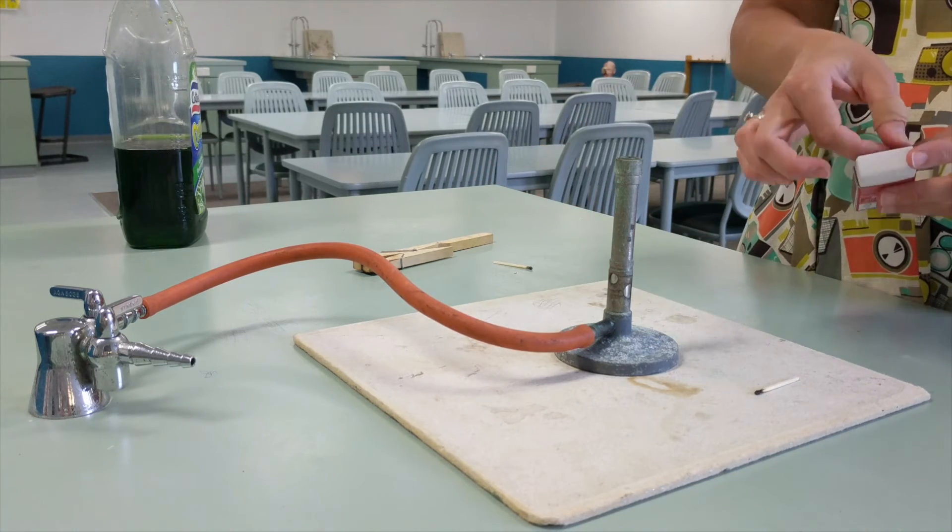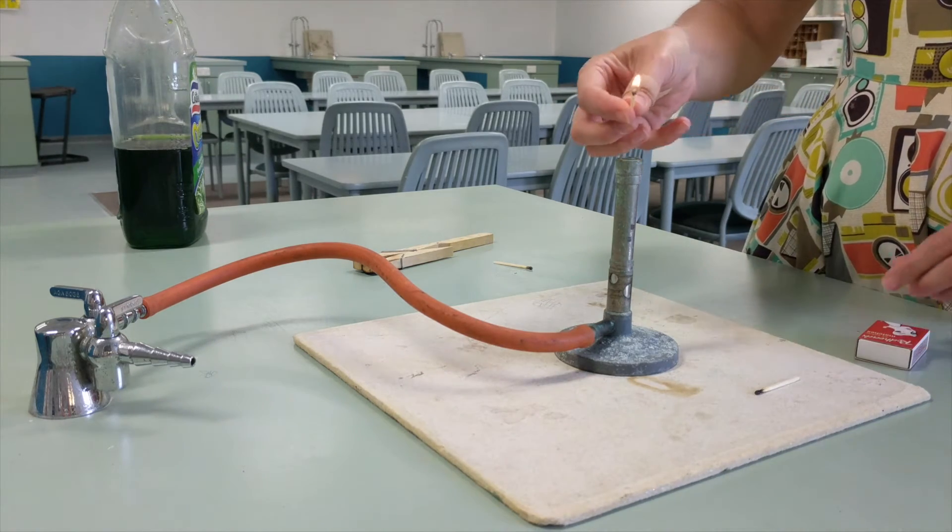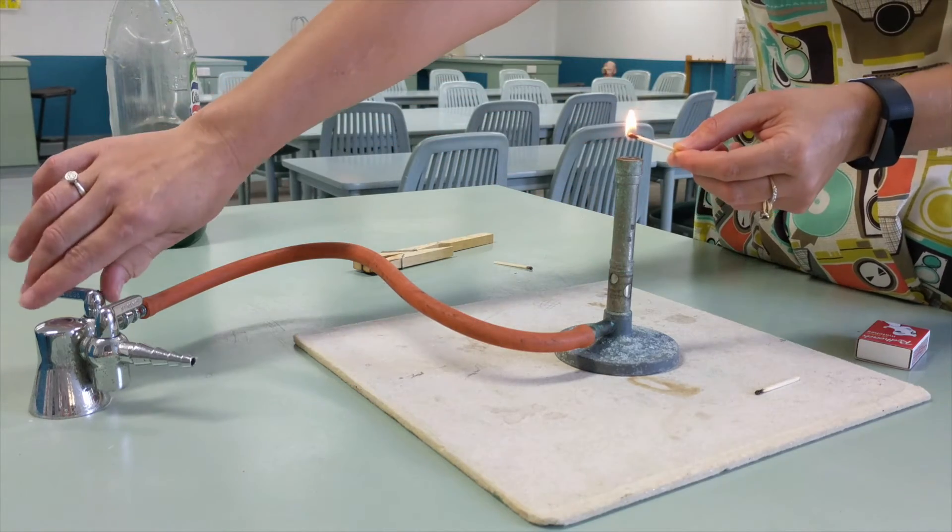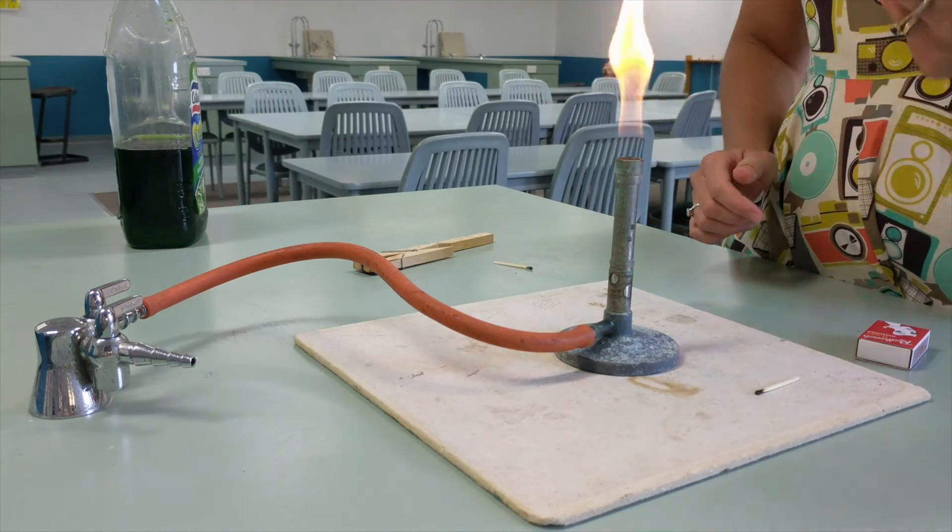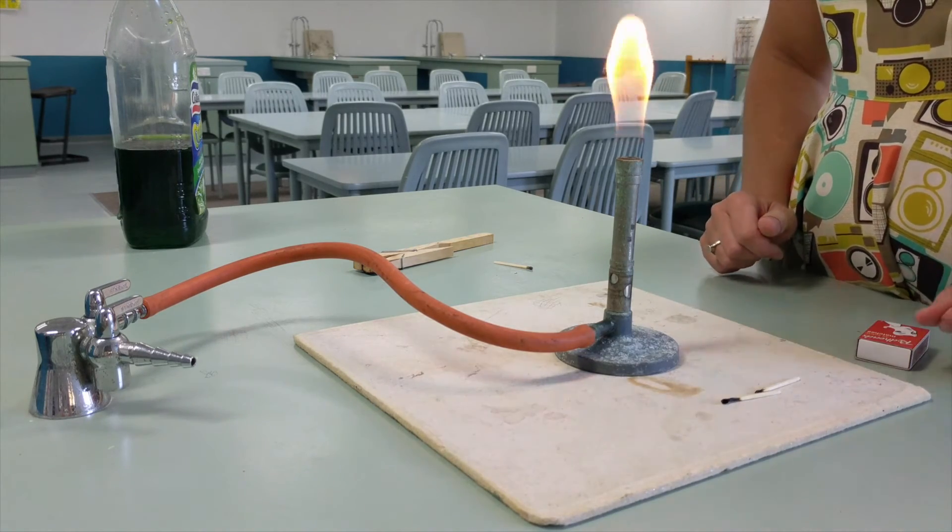Next step is to light a match. And then either you or your lab partner can turn on the gas. Make sure you shake the match out. Don't blow it because you might accidentally blow the Bunsen out.